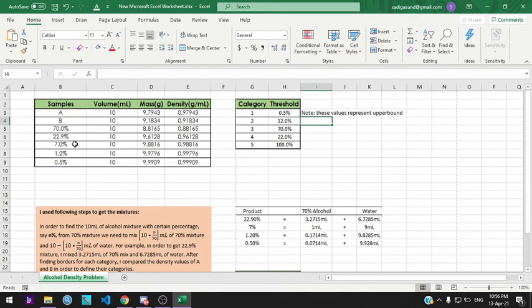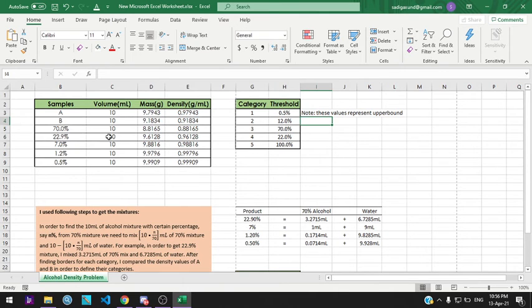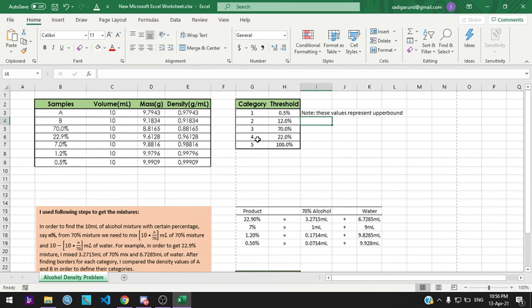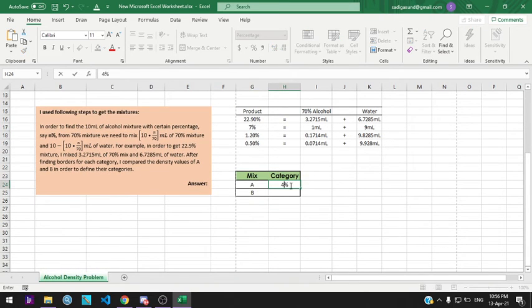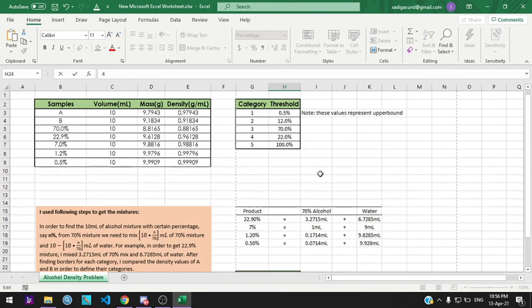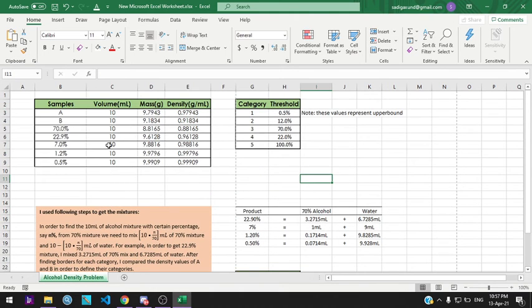Our beverage A is less than 22.9%, so it is in the fourth category. We record the answer.